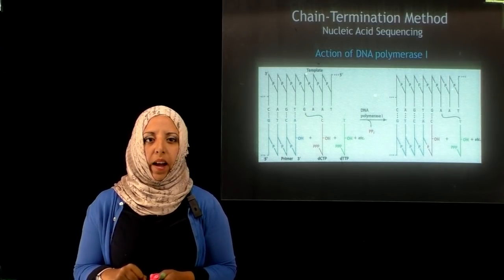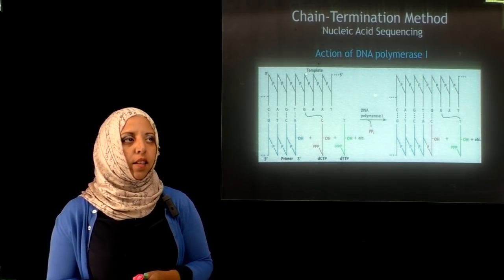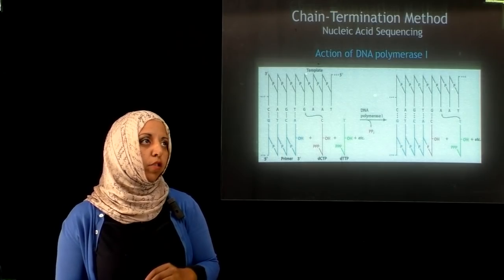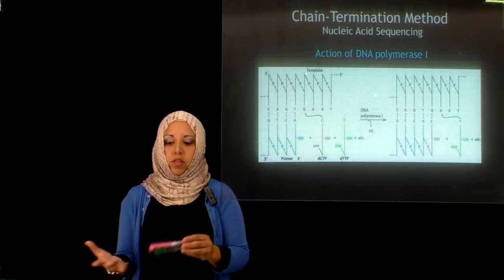It is also named after its founder, Frederick Sanger, which is now known as the Sanger method, right? He also won the Nobel Prize in chemistry in 1980 for his achievement. All right, so what exactly is the chain termination method?